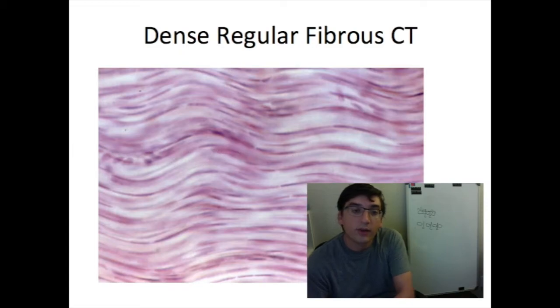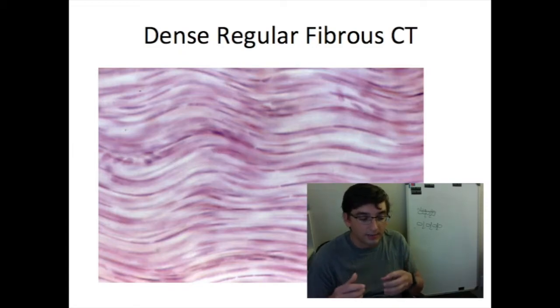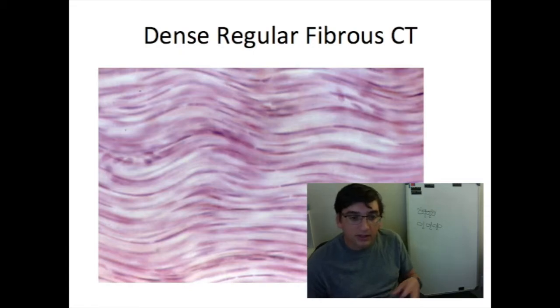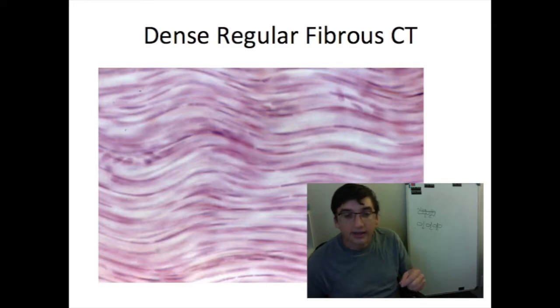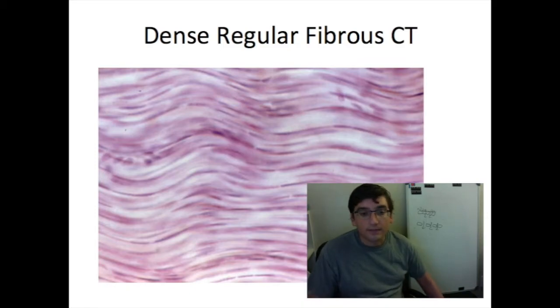The reason it's a little wavy is because the fibers are relaxed. Like there's an elasticity to them. It's like a rubber band. You pull it and it'll go straight, but if you let it relax, it'll have a little bit of a curve to it. And so that's why there's that wavy look to it.